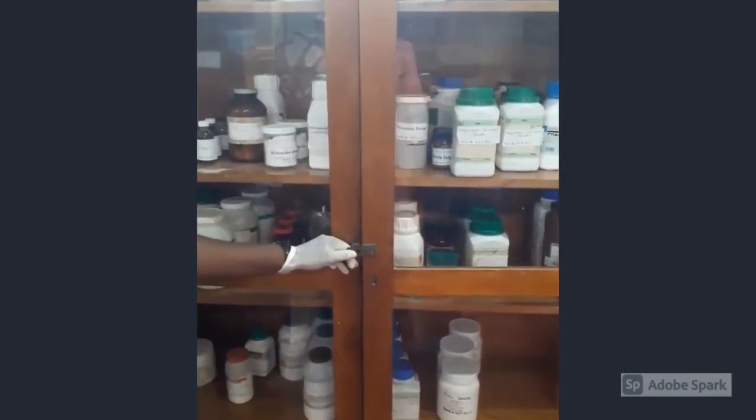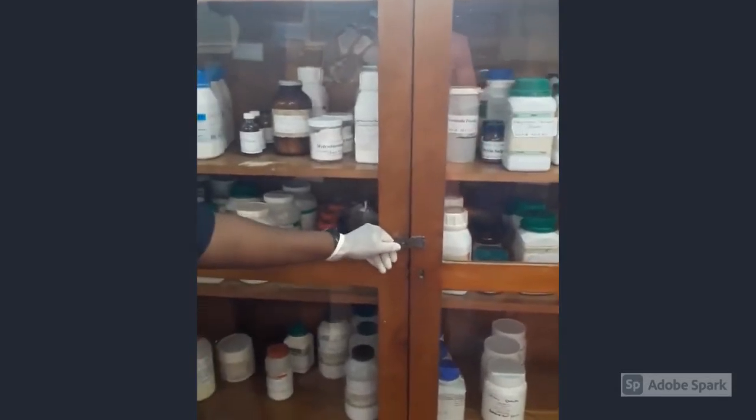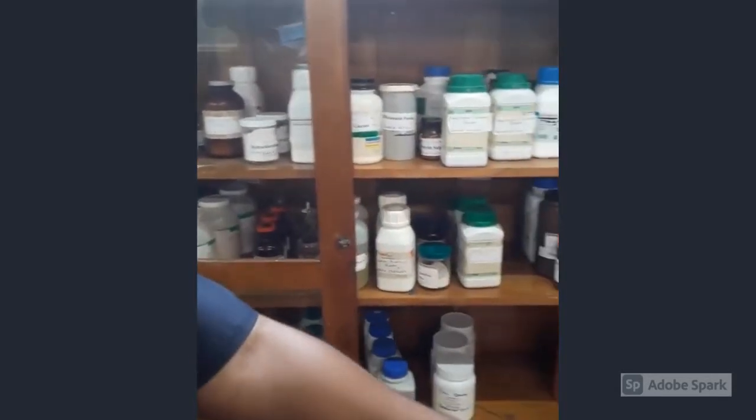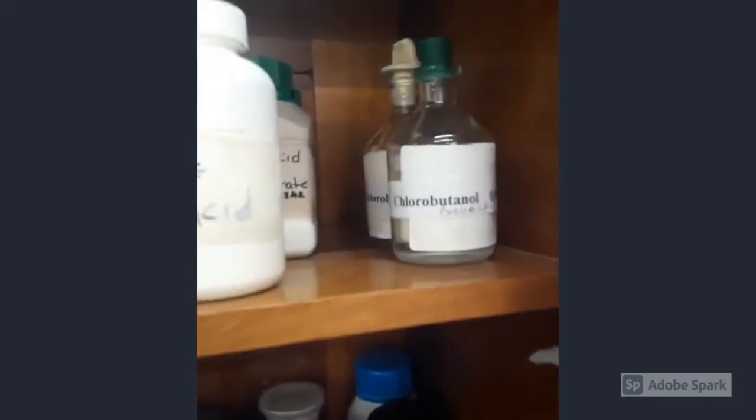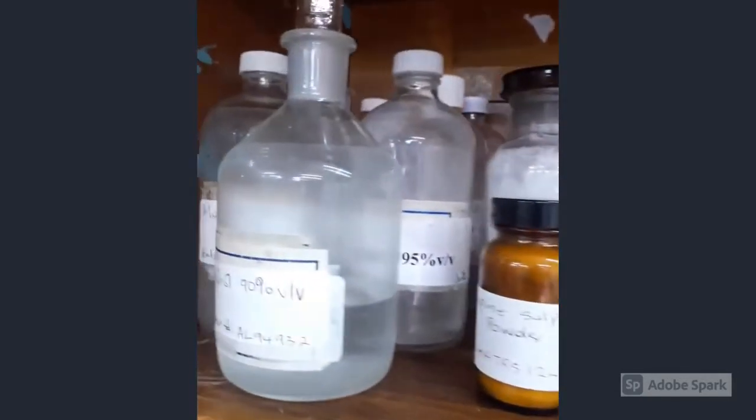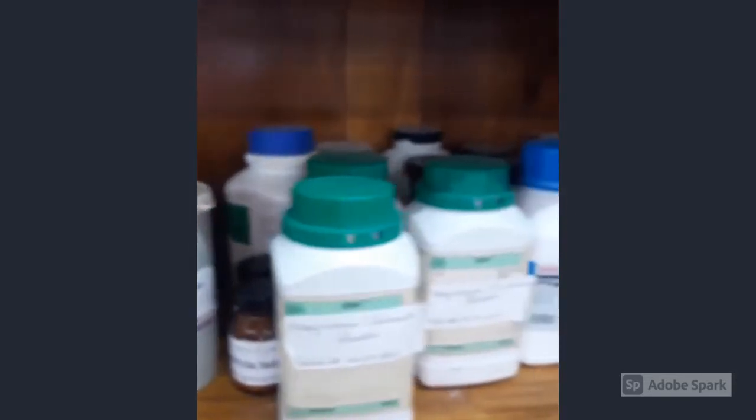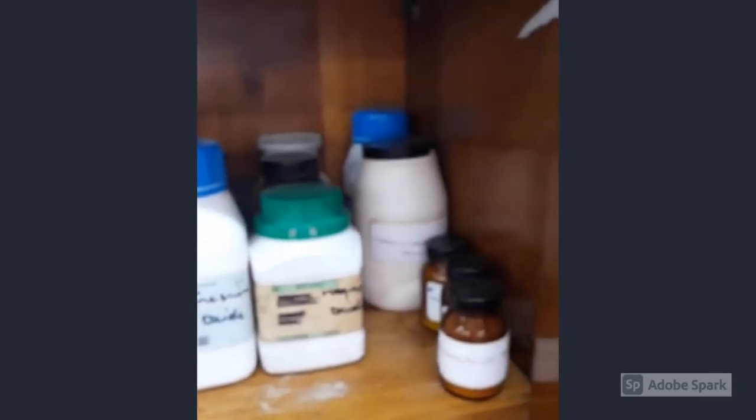We have a cabinet at the front that have your ingredients in it. It is also stocked from the top to the bottom shelves, and it is also placed in alphabetical order. And the things that you take from the shelf as you do with your benches, you're supposed to return them in the alphabetical order that you took them from, so that other persons will understand and find where their stock drugs will be that they can use to make their products.